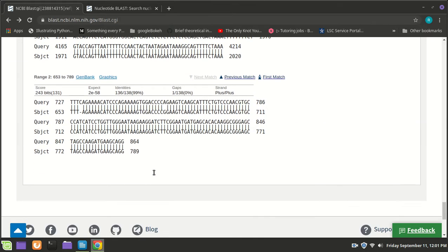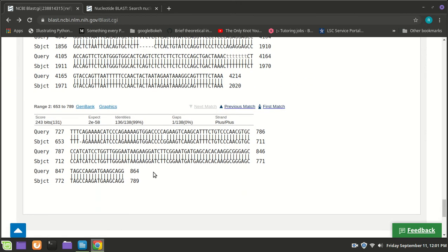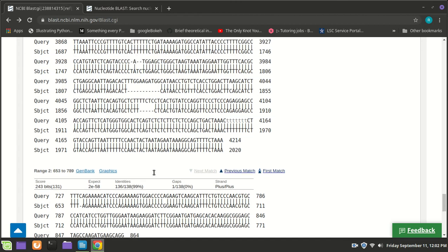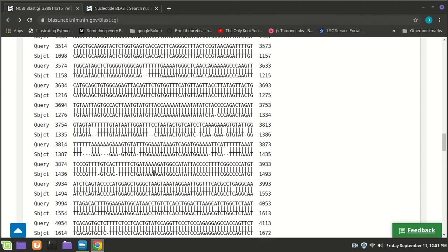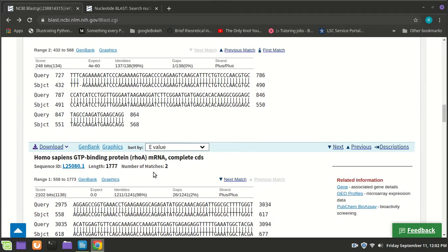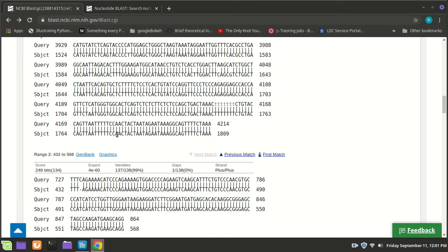So you're getting many because it's like first and second, first and third, then second and third, and then it goes back and puts the other one on top and starts backwards. So that's why you get so many. So 2 of these are essentially identical. Half of these are identical to one another, because they just switched them with a different one on top.